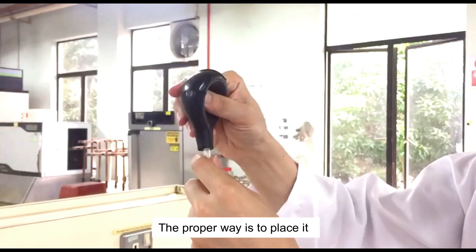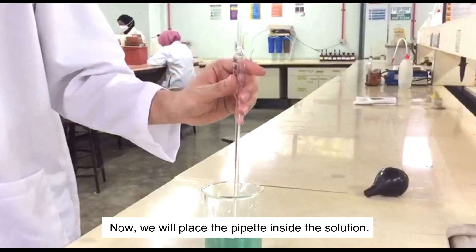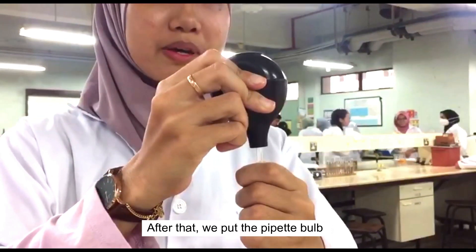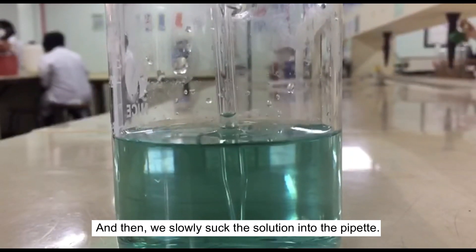The proper way is to place it on top. Now we will place the pipette inside the solution. After that, we put the pipette bulb on top of the pipette, and then we slowly suck the solution into the pipette.